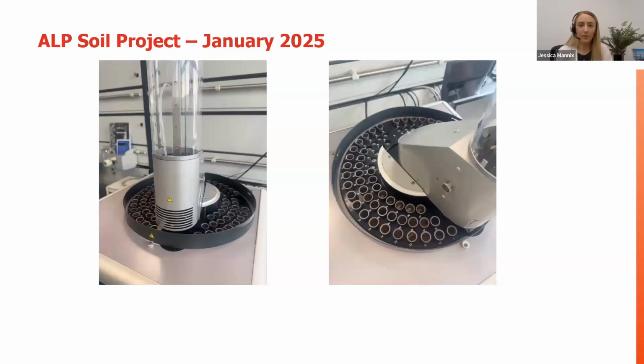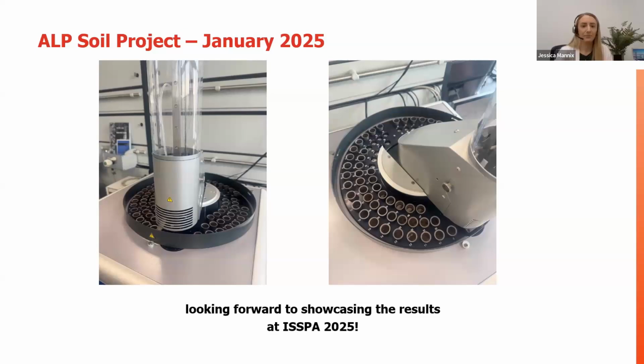This is just a photo of real life that I took when I was over in the application lab in Germany that I was talking about, where we are headquartered. And this is what the auto sampler looks like when it's filled up with those reusable sample crucibles. I had sat there at the balance, prepared these, brought them over on a sample tray, and using tongs, I just loaded them into the auto sampler.